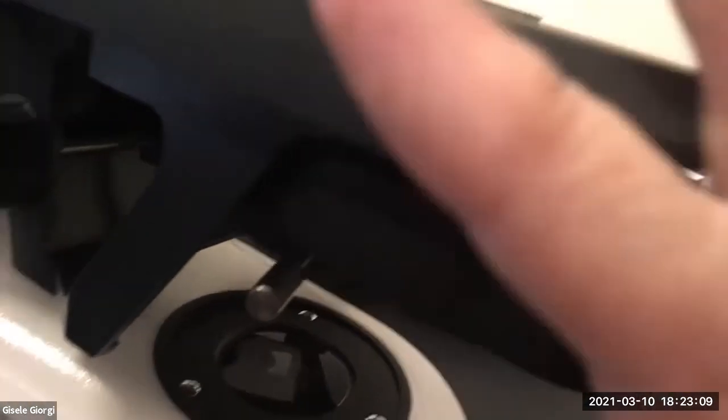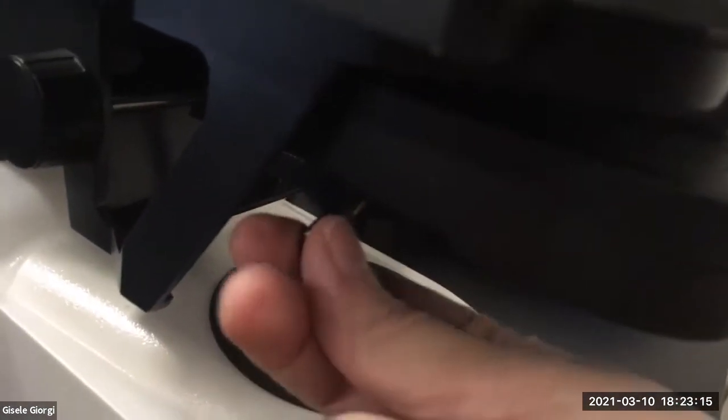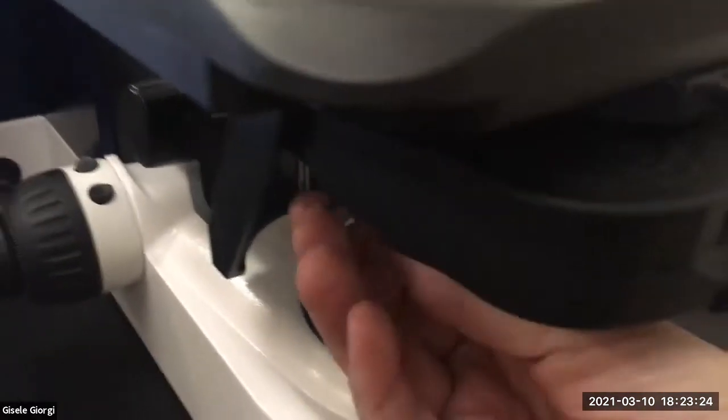But anytime you're on a scope, proceed gently and with caution. You know the three things not to do to the scope. It's fine to play around with screws, but just be aware that things might fall out. So always be kind of ready and hovering with your other hand. Okay, so I know these are the centering screws, so I'm going to play with them.